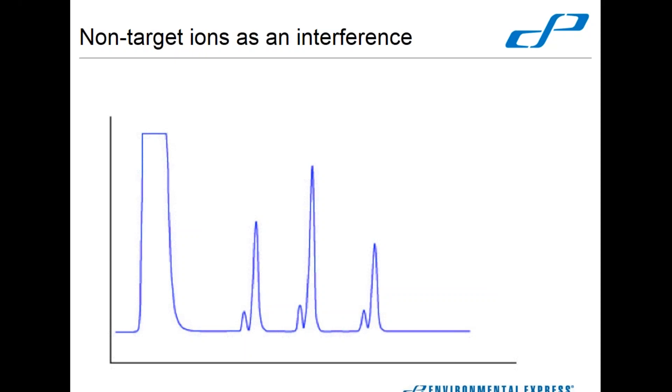Occasionally we get some non-target ions as interference. This generic example shows something that has plateaued out — pretend that's our normal seven wastewater anions. That's most likely a very high chloride concentration that has eaten your fluoride and nitrite peaks — they're just gone. At that point, dilution is our friend, and we hope that the rest of what we're looking for can be separated out. If you were looking for nitrite specifically, you would have to dilute so much that you'd probably just have to raise your reporting limit and report a non-detect.